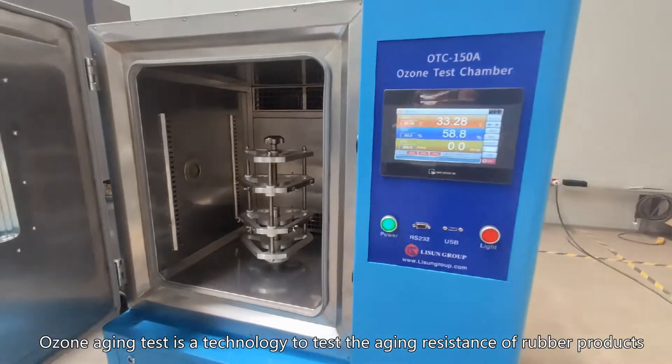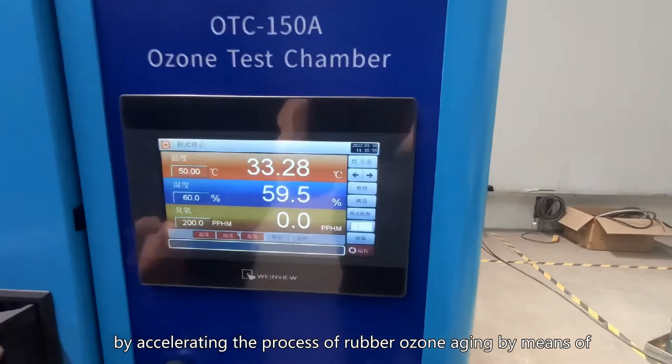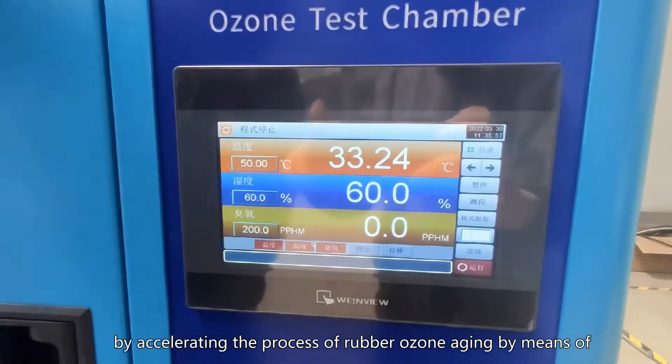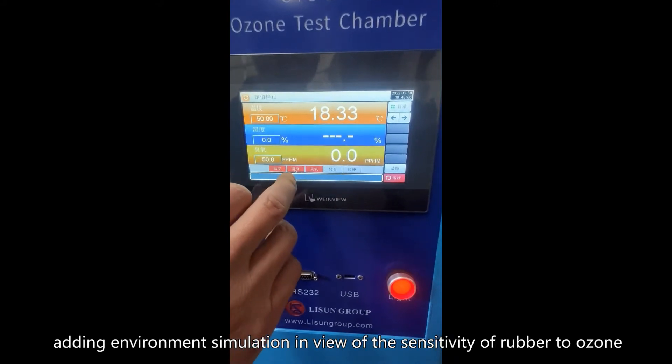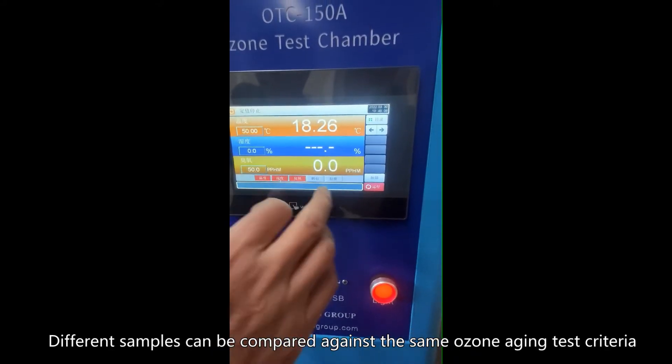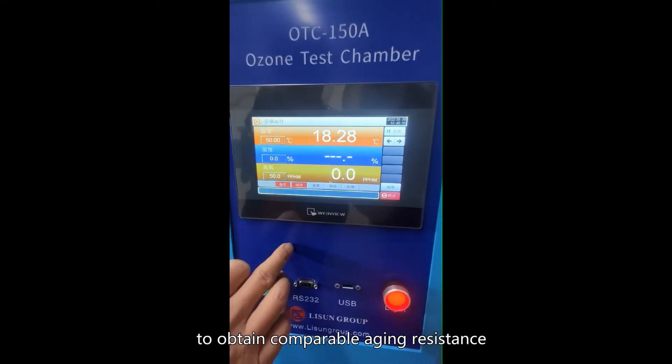Ozone Aging Test is a technology to test the aging resistance of rubber products by accelerating the process of rubber ozone aging by means of adding environment simulation, in view of the sensitivity of rubber to ozone. Different samples can be compared against the same ozone aging test criteria to obtain comparable aging resistance.